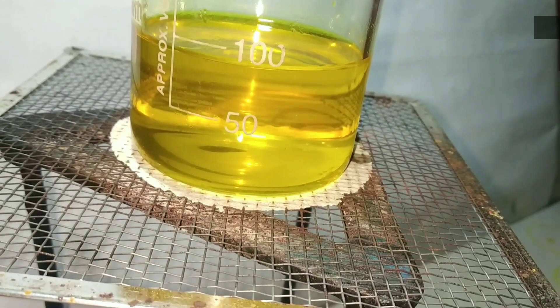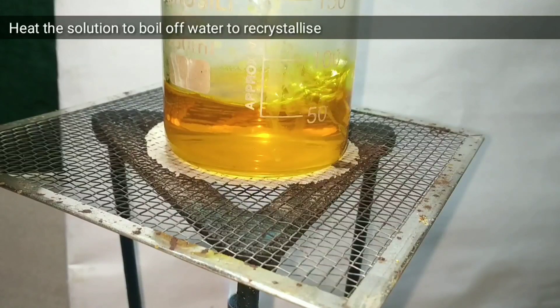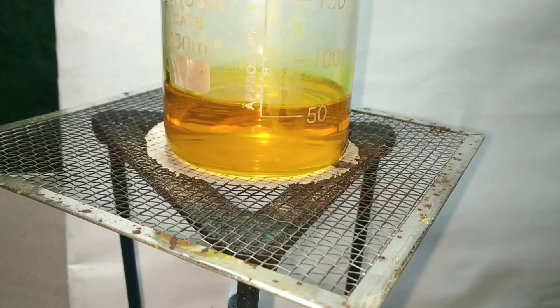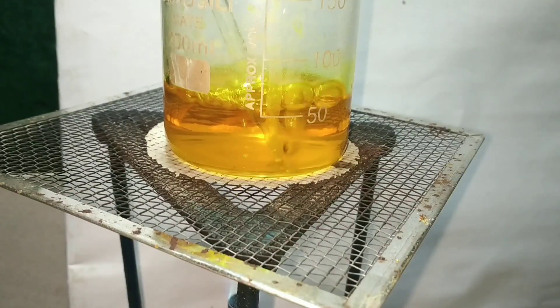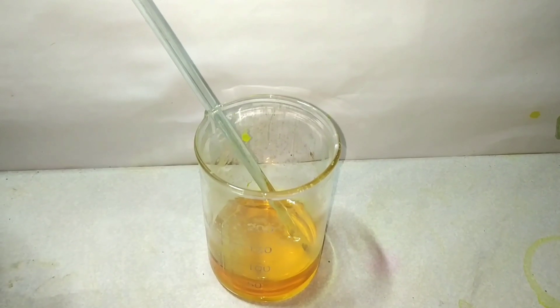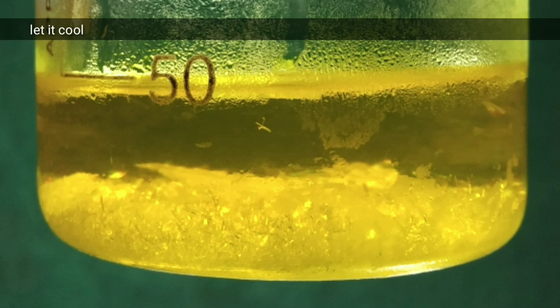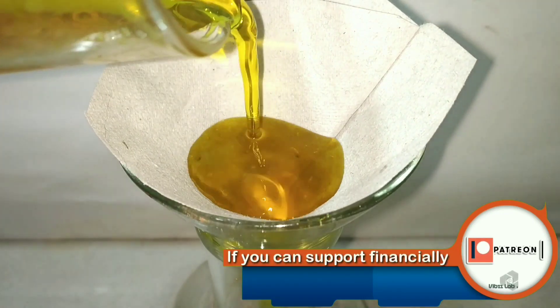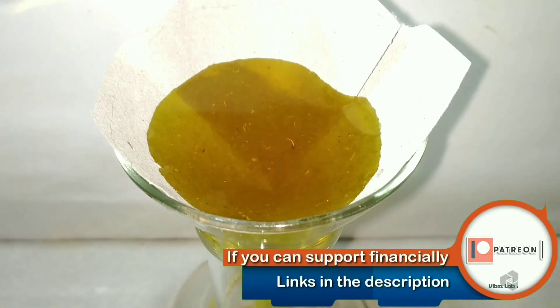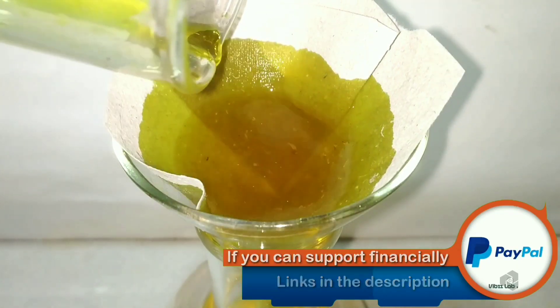Now I heated the resultant solution to boil off the excess water for recrystallization. After that I let it cool down to room temperature and then I decided to keep it in the refrigerator to cool overnight. On cooling you can see the crystals have started to appear.